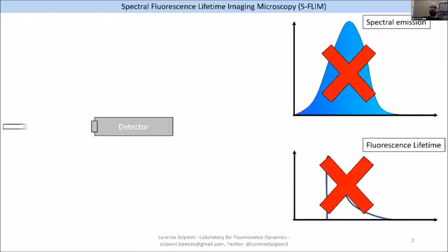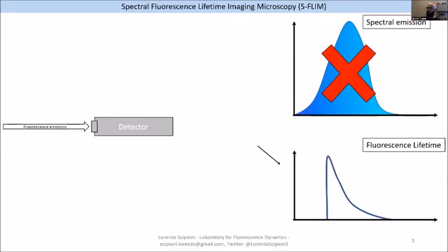So this is all very interesting, but all of this information is actually lost in normal microscopy settings, right? So all the fluorescence emission is simply integrated by the detector, and we don't have these layers of information that allow us to know more about what the fluorophores are doing. Some systems, as you have also seen throughout this workshop, have dedicated electronics and excitation modality, and can actually detect the fluorescence lifetime at every pixel.